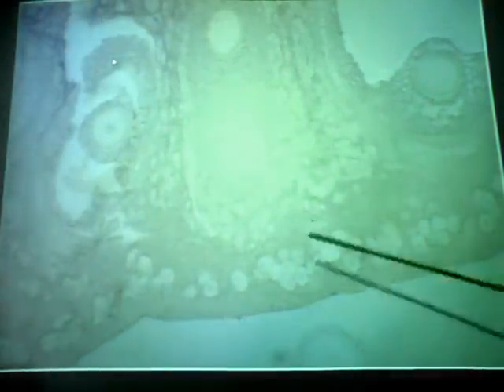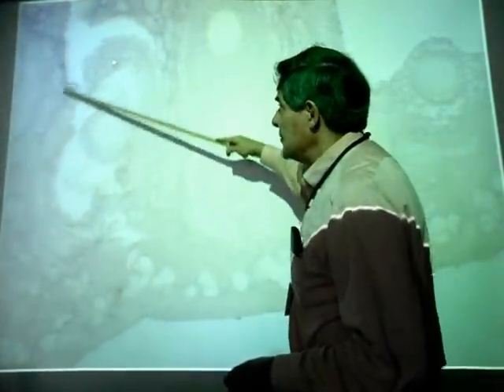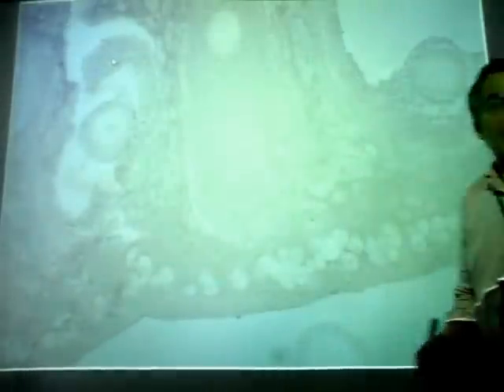This is characteristic of a secondary follicle. Here's another secondary follicle. It's kind of beat up. You can see here's the egg cell, nucleus, and cytoplasm, the corona radiata, and this is the rest of the follicle, which is torn. But again, it's got a fluid filled cavity. Secondary follicle. And again, they go through stages. It's not just bang from the primordial to primary. It grows and develops. And here's another secondary. There's the corona radiata, there's the egg cell, there's the antrum.